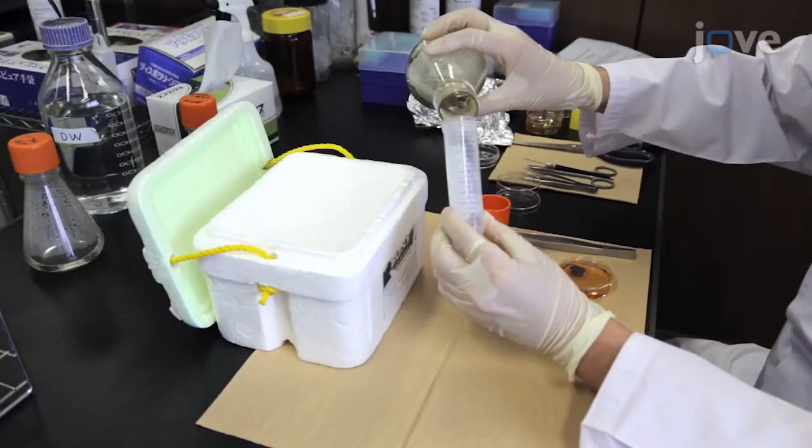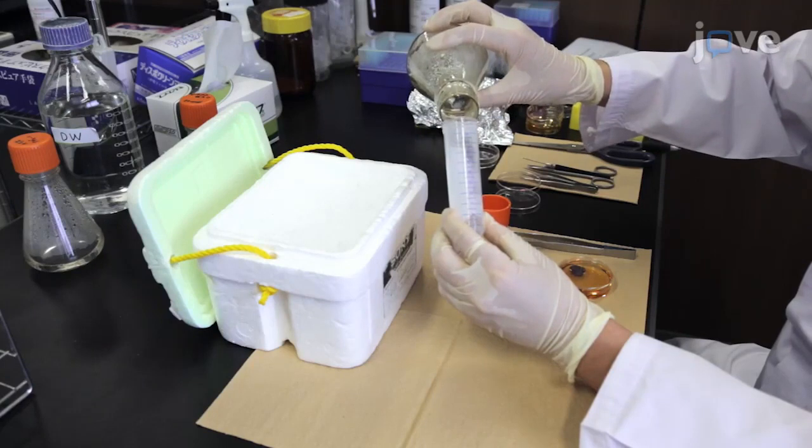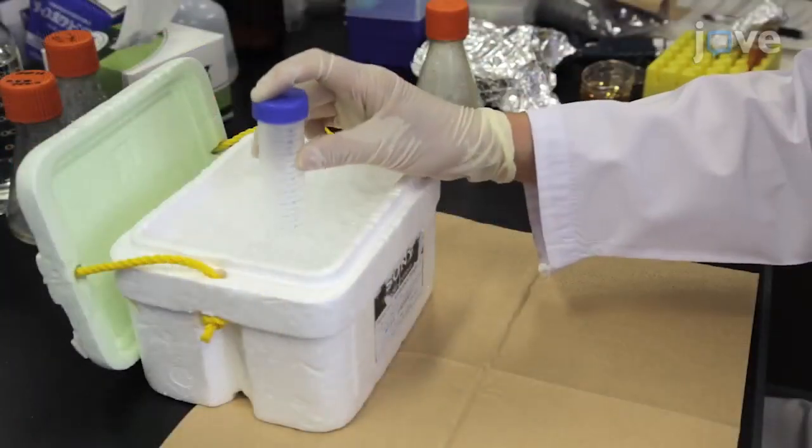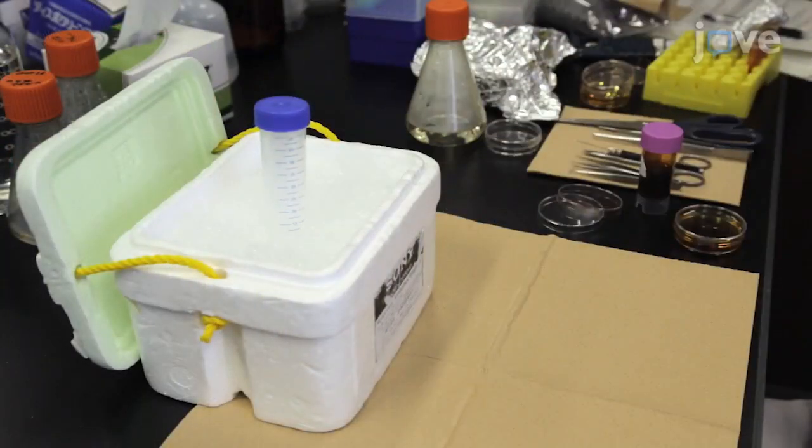Then add 20 ml of 0.5% agarose to the tube. Place on ice until the agarose begins to harden.